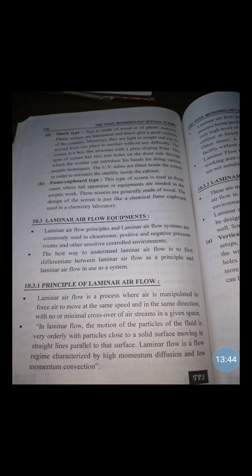The laminar airflow principle and the laminar airflow systems are commonly used in clean rooms, then positive and negative pressure rooms, and other sensitive controlled environments.